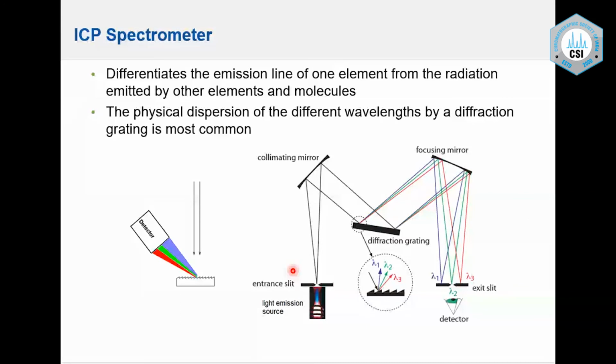So this bunch of wavelengths is then introduced into the optical system, which is going to fall on the detector. Before the detector, we need to do filtration. We need to separate all these wavelengths, so a grating is used here. This grating is capable of dispersing all the wavelength spectra, and the selected wavelengths then fall on the detector and get scanned.